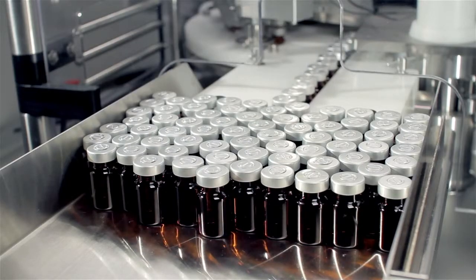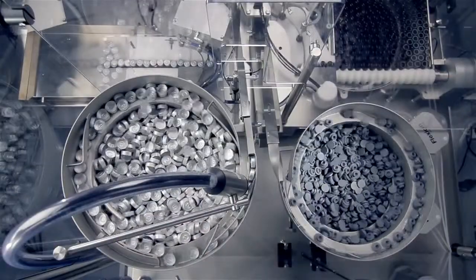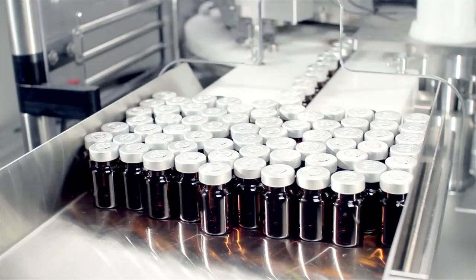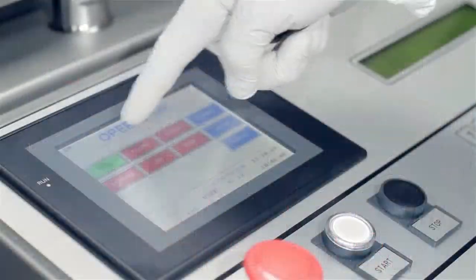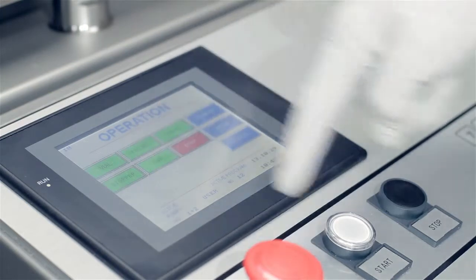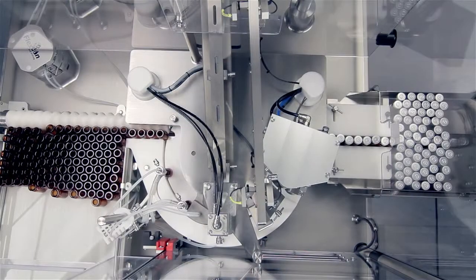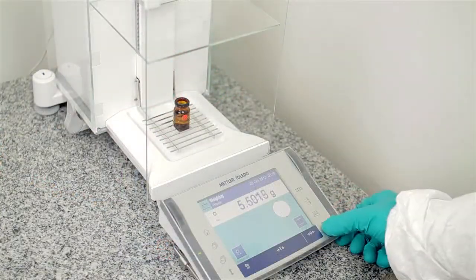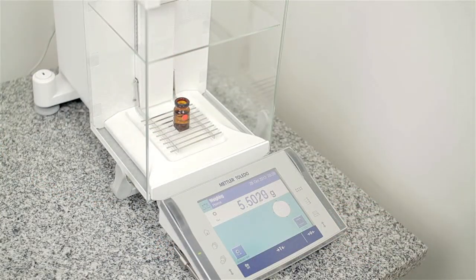Production costs are minimised as just one operator is required to feed the machine with vials, stoppers and caps and remove the final product from the outfeed. An intuitive HMI ensures easy changeover without the need for support from outside the cleanroom. Calibrating the fill volume is easily done and documented using a standard balance connected to a control panel.